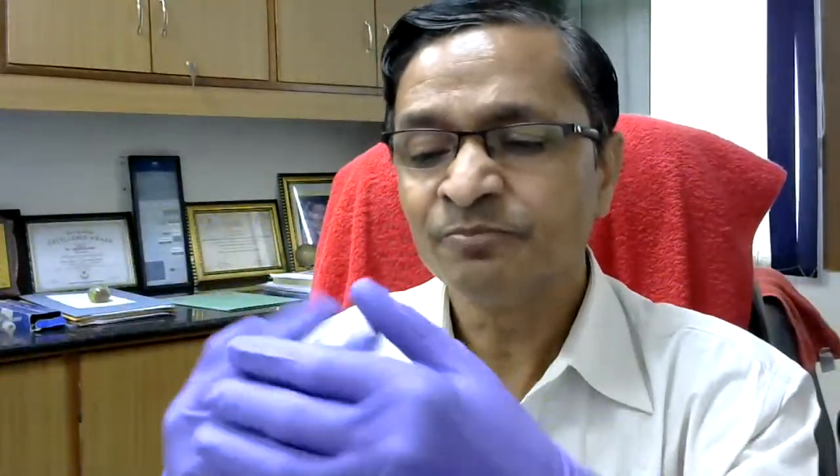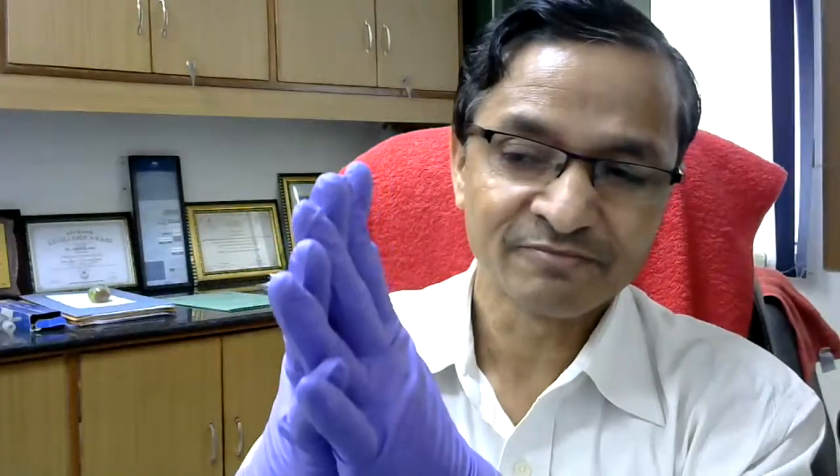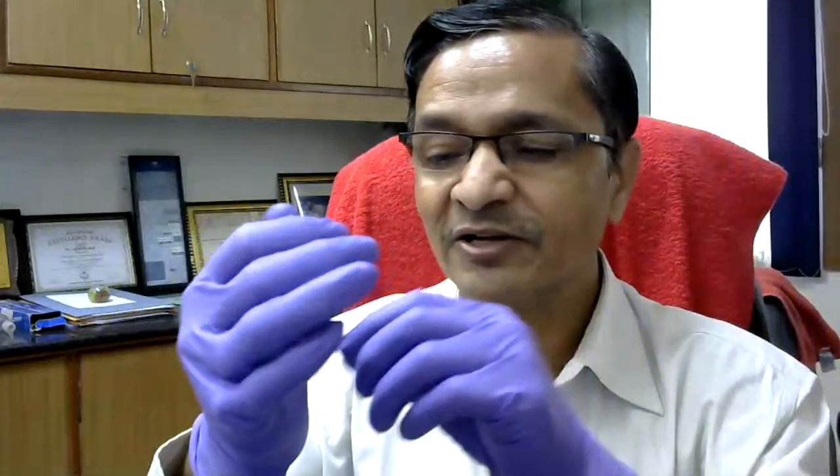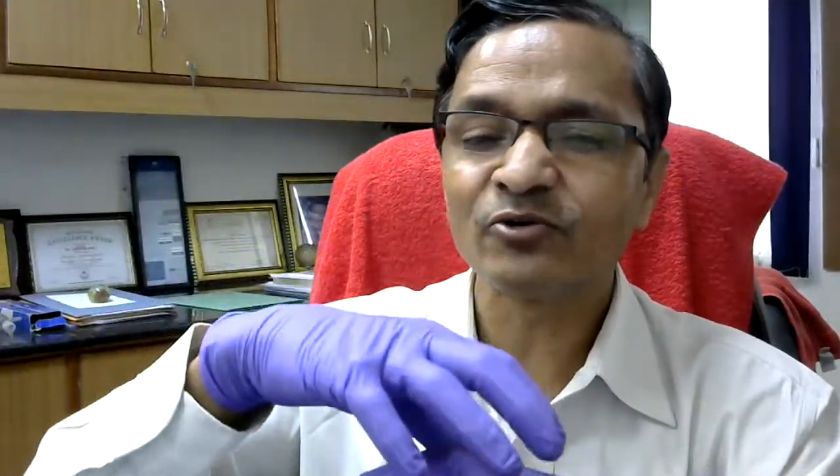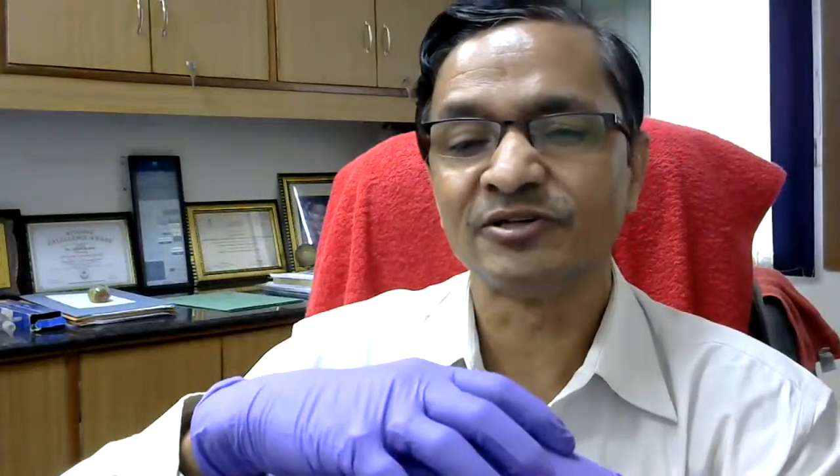Now, since I have been working with ethidium bromide, this is full of it, and I want to remove it. So how to remove it? If I remove one glove somehow and then just try to pull this, you are going to touch ethidium bromide directly.